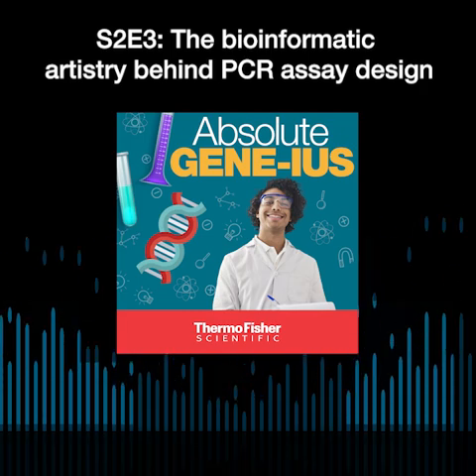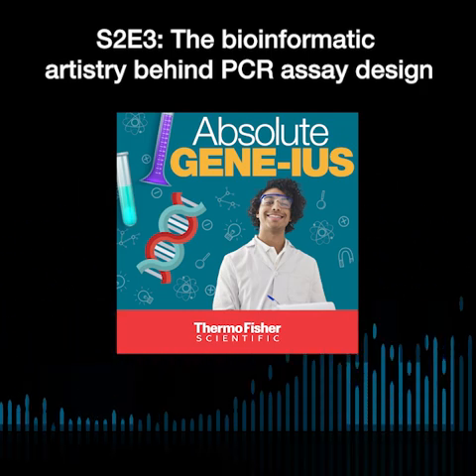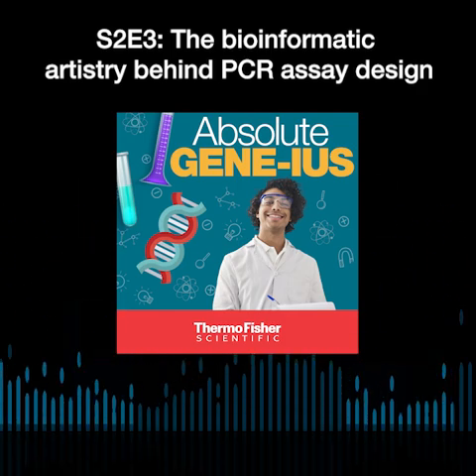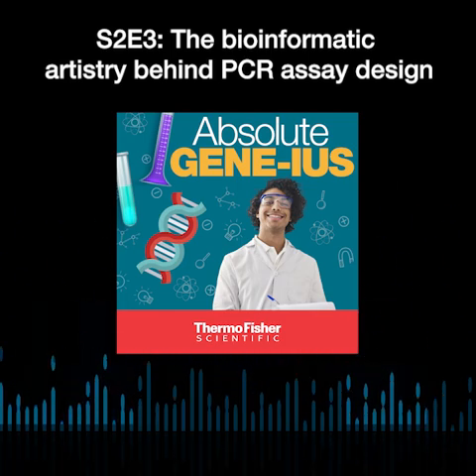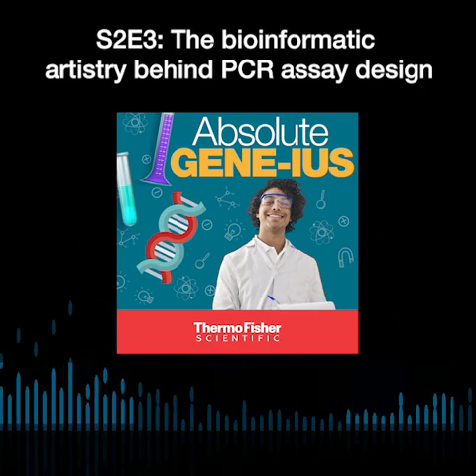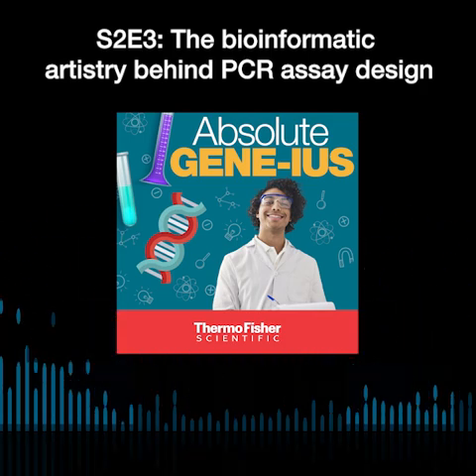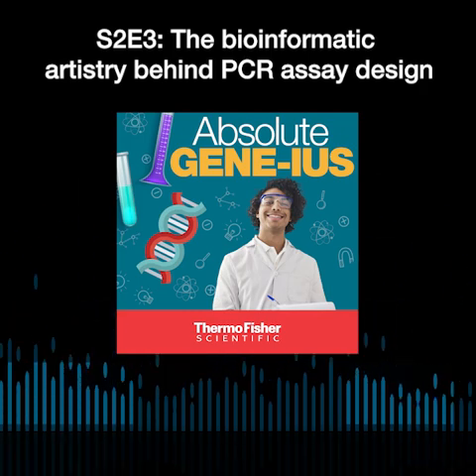Digital PCR, the readout is at the endpoint, right? And in qPCR, you have a real-time readout. And so sometimes when an assay does not perform so well in qPCR, you might see that it still performs well in digital PCR because the readout is at the endpoint. Design considerations differ slightly, but overall, I do see that the transference of an assay from qPCR to digital PCR is quite high.